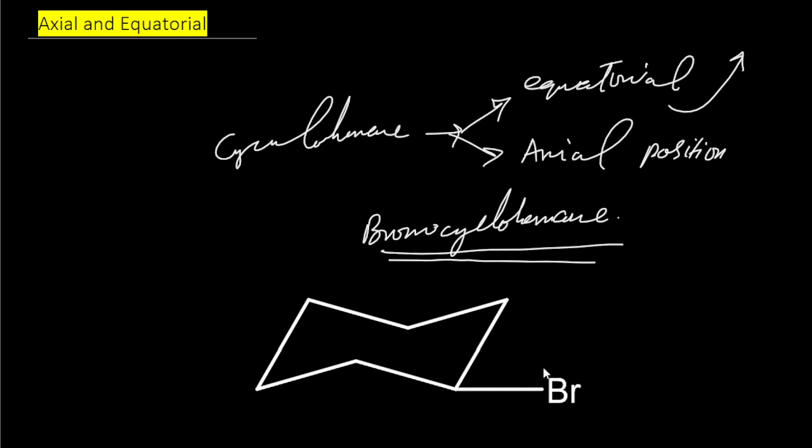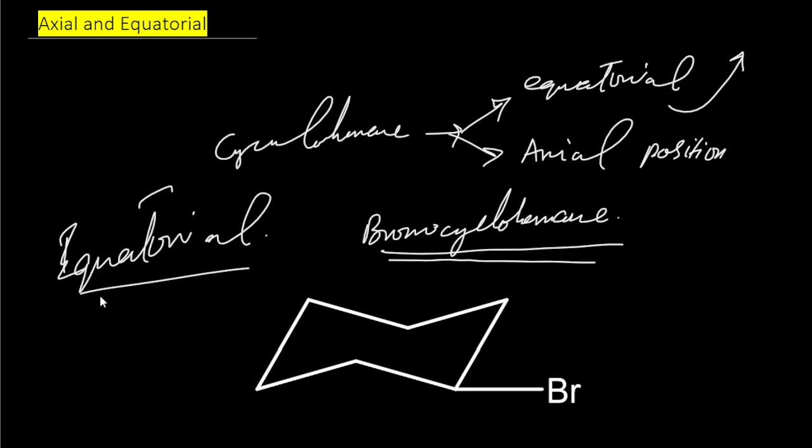When a substituent is attached to the cyclohexane ring, it always prefers the equatorial position. So how to verify that, how to verify the result? This is the correct one. We can use NMR to verify these results. So I am talking about the advantages of NMR. What are the applications of NMR?